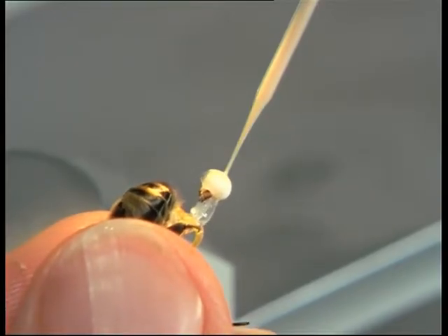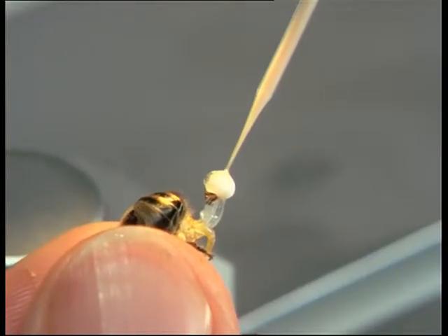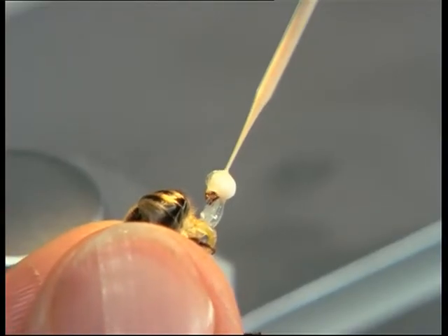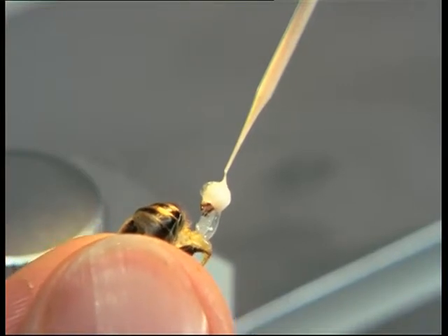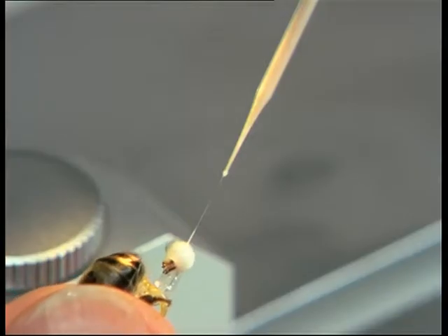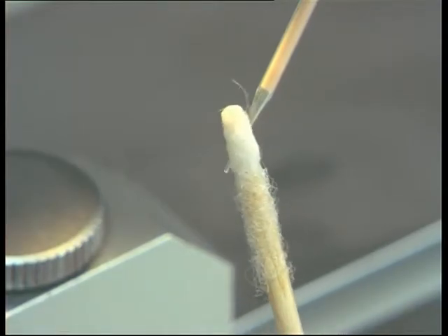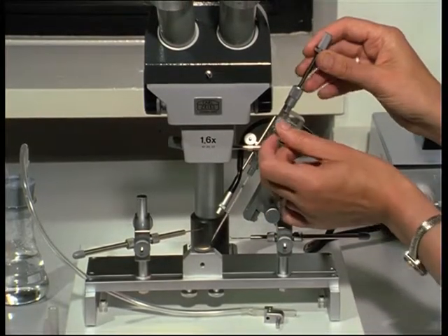Similar to the natural mating process, the semen of several drones is aspirated in portions. A minimum of 8 microliters are required for insemination. This corresponds to the quantity of semen donated by 8 to 10 mature drones. If necessary, the tip of the cannule is cleaned off with a sterile swab. A drop of diluent closes the capillary to prevent the semen from desiccation. Now the syringe is ready for insemination.